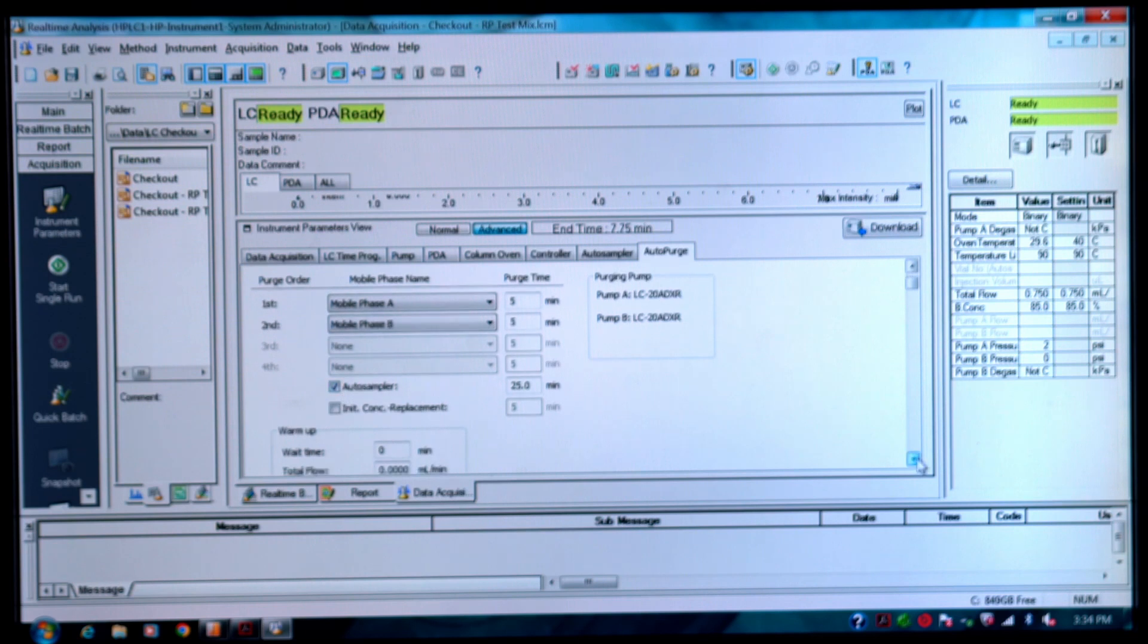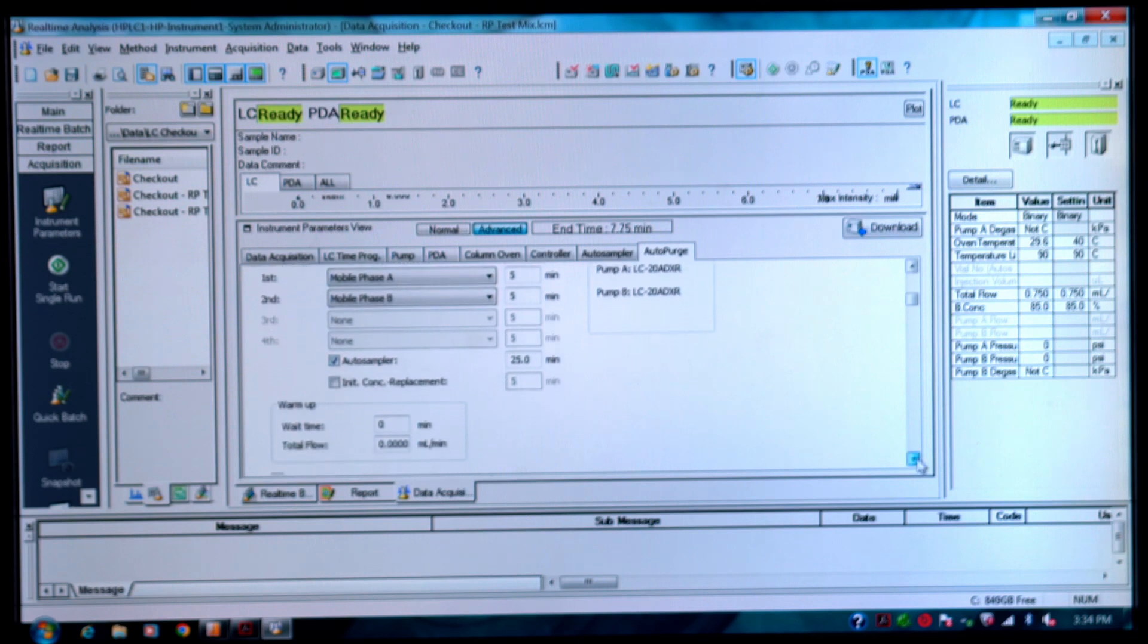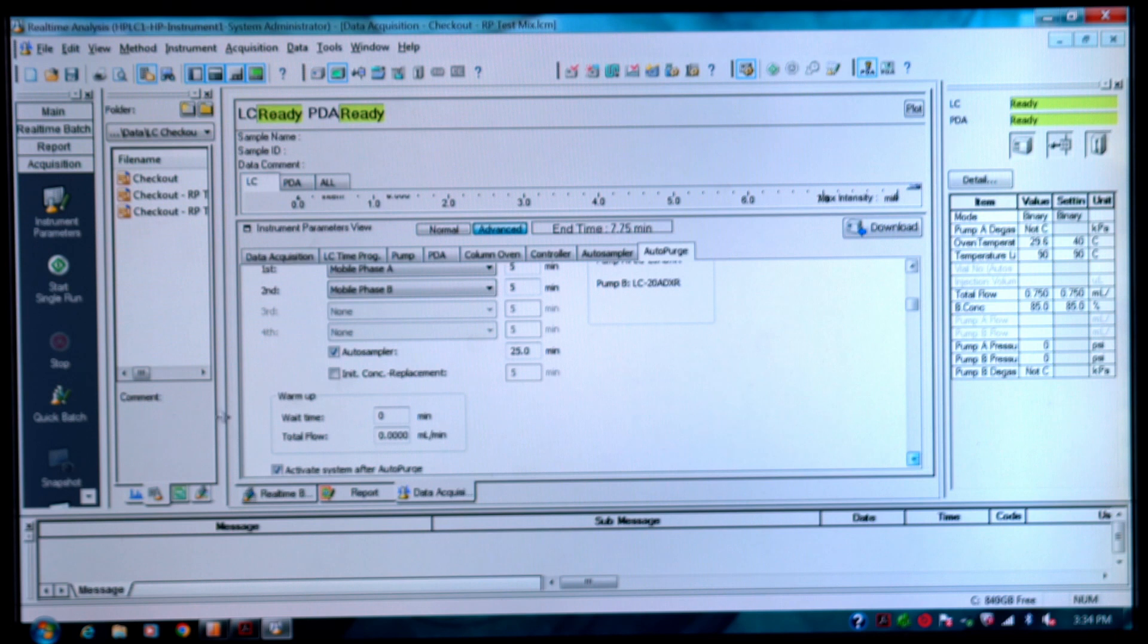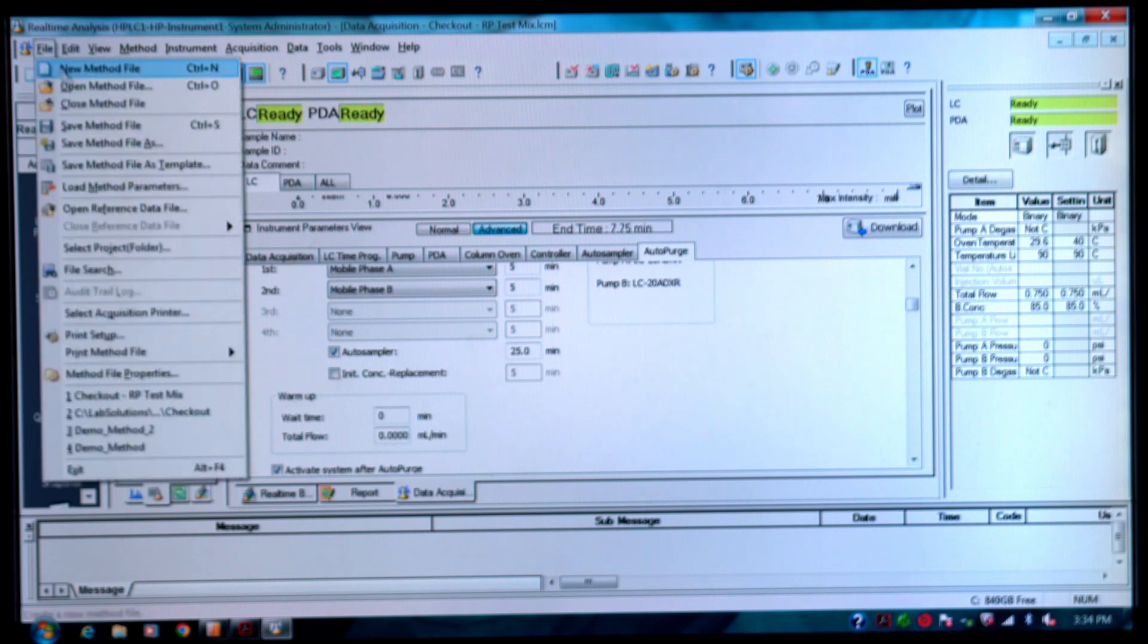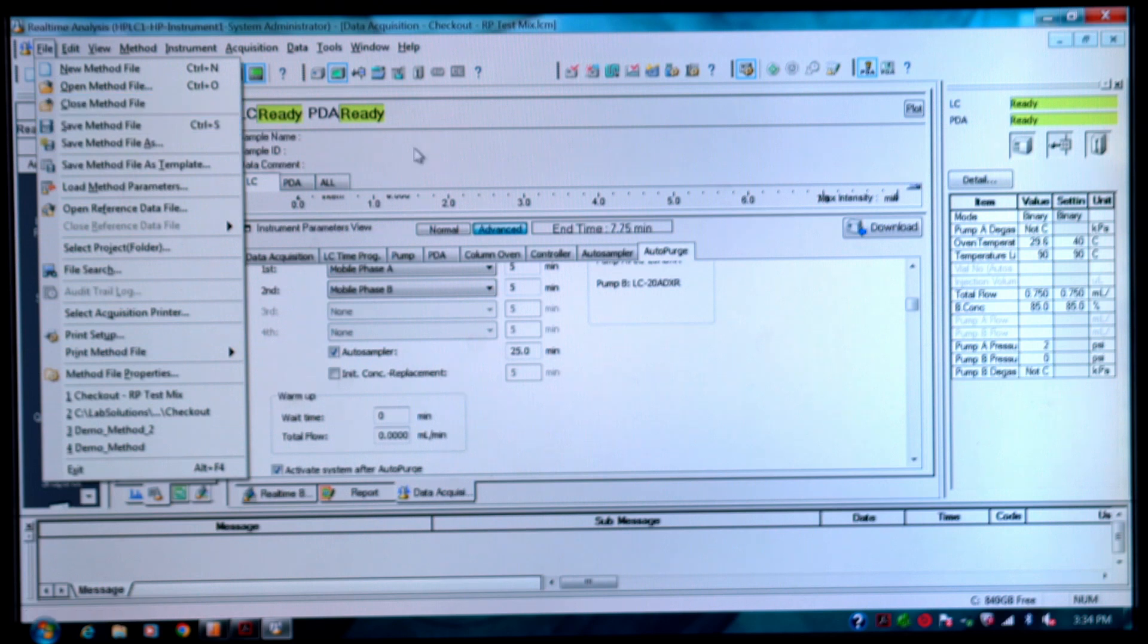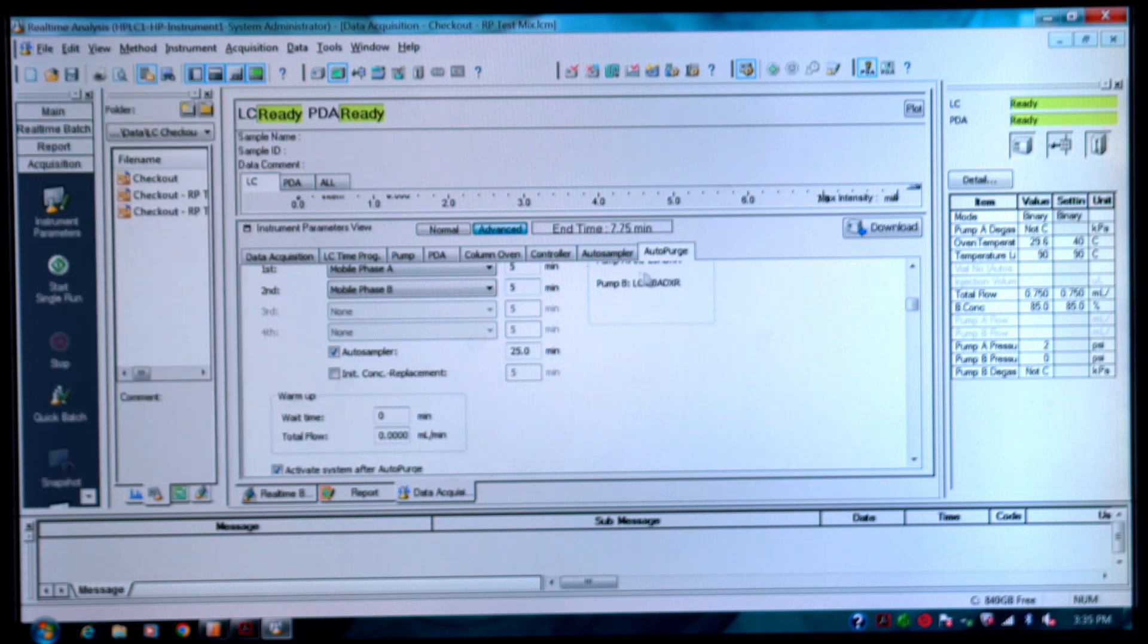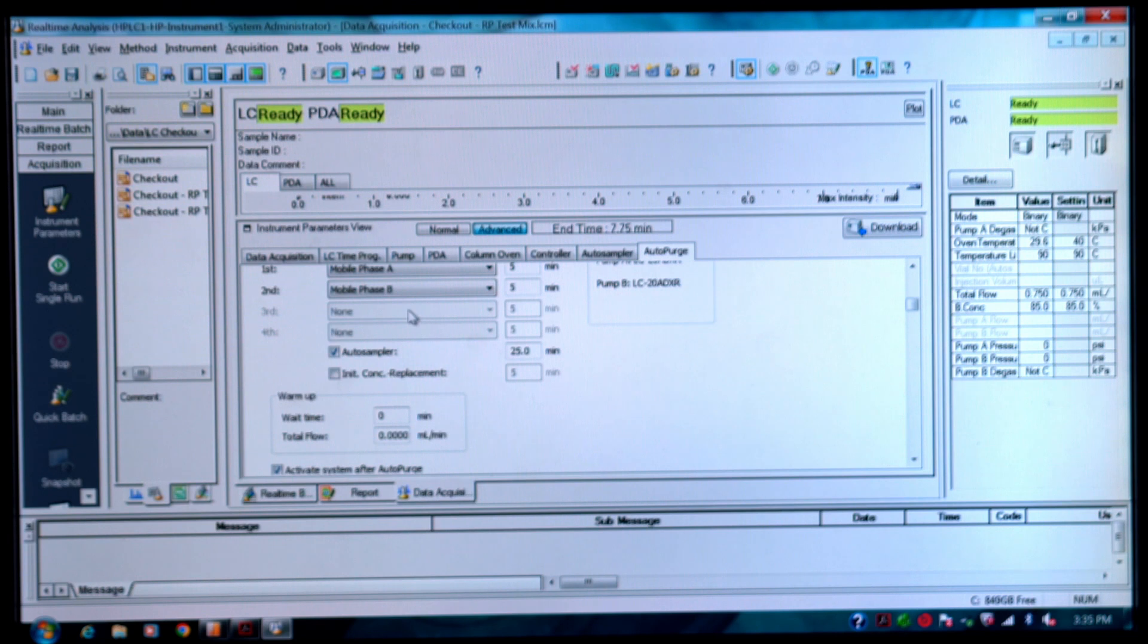If you wanted to specify a warm-up time you could do that if you'd like. When you save, you want to go ahead and save the method file. The purge is now going to be part of the method file so that when you run your sample it's going to be there.